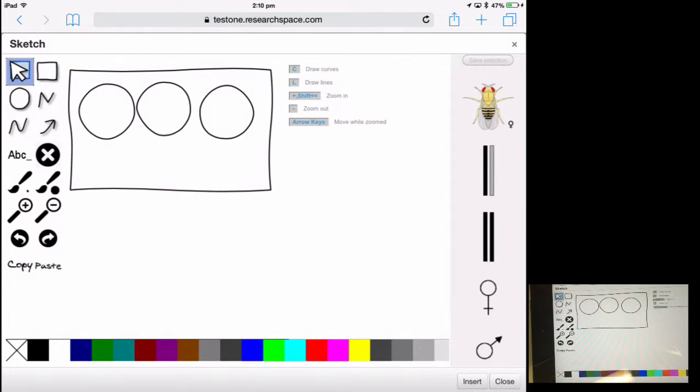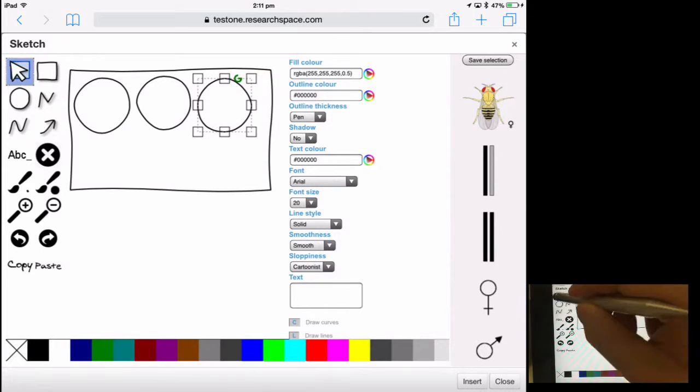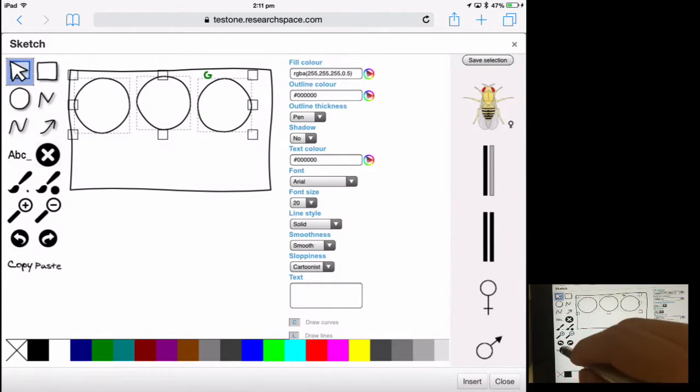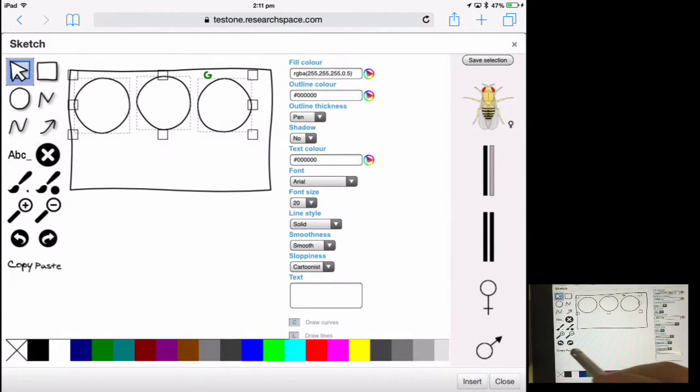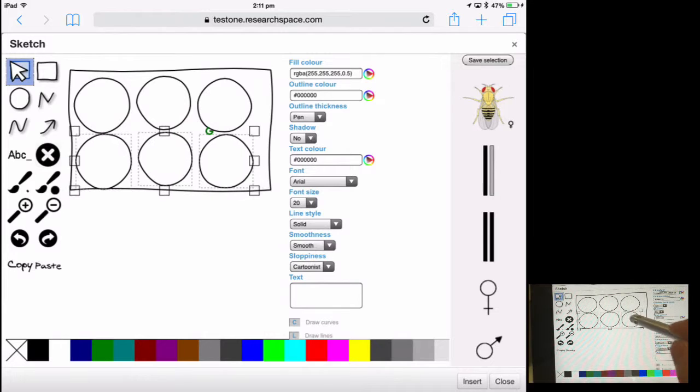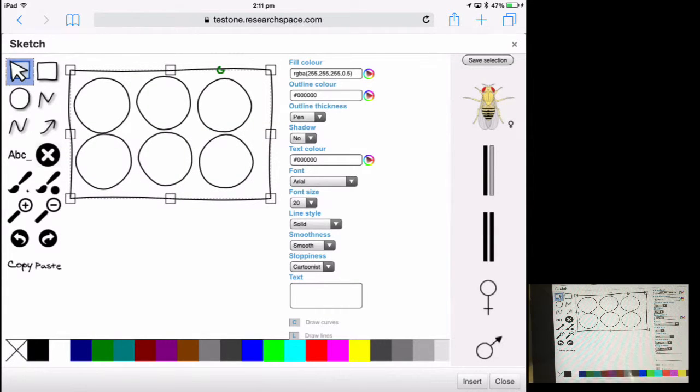If needed you can also select multiple items using the marquee select tool. You draw a big box over the items you wish to select, and you can also tap the copy and paste button.